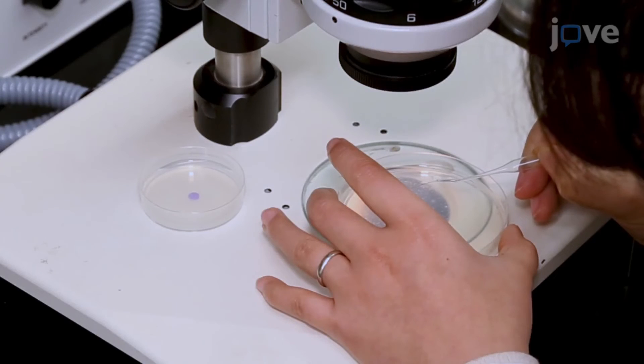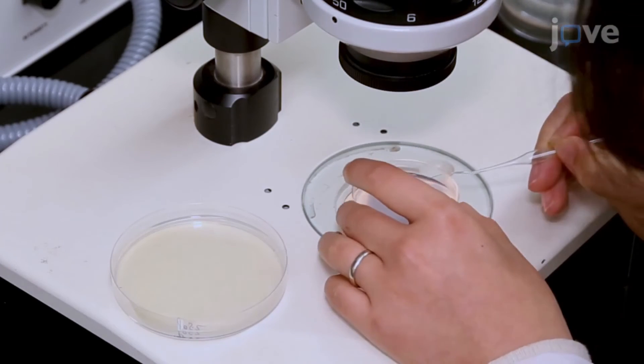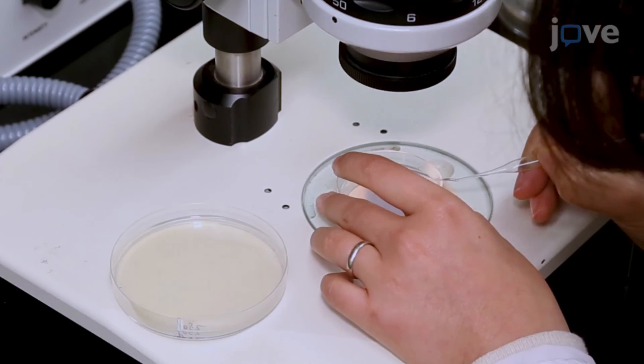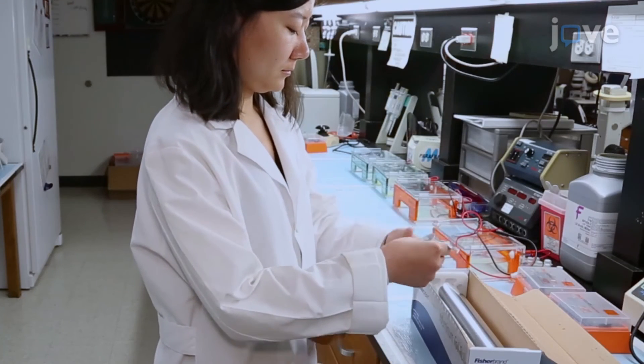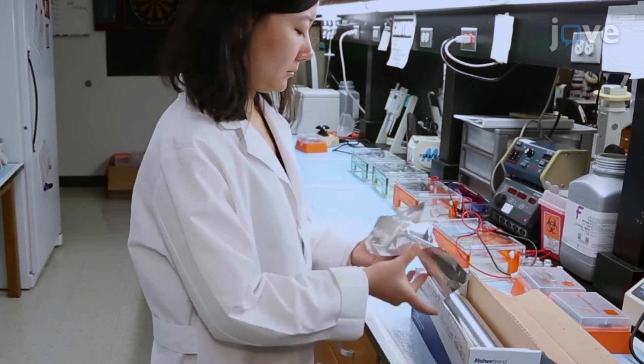Pick approximately 100 males to the mitodye stained food dot on the male staining plate. Wrap the plate in aluminum foil and incubate overnight at 16 degrees Celsius.